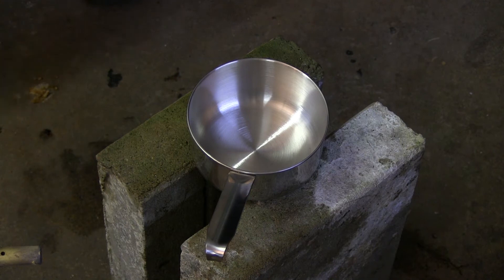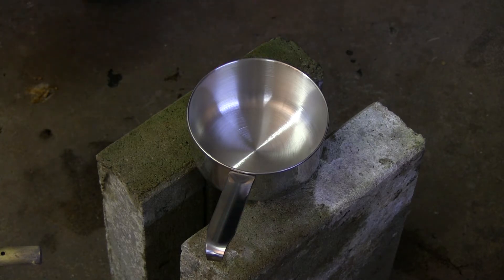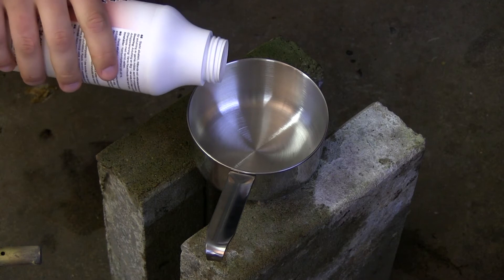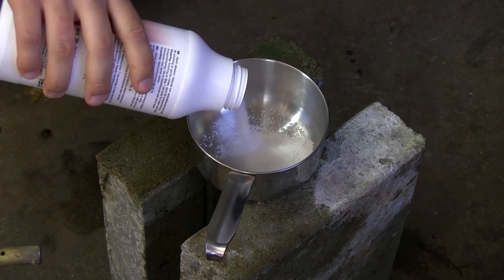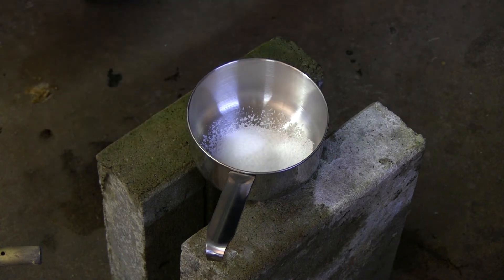Now that I have all the ingredients ready, I'm going to start by putting my safety gear on. After that, we are ready to start. I'm not going to put the gloves on yet, because this is pretty harmless when the sodium hydroxide is in its powdery form. We're going to start small — if anything goes wrong, it'll be easier to clean up.